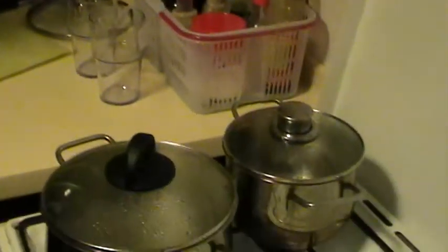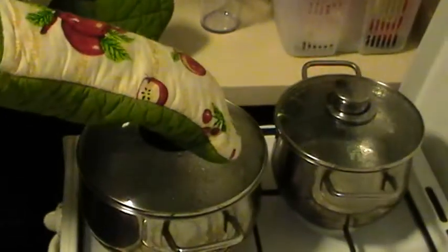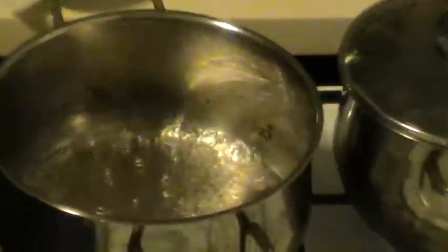So it's now about 5 minutes and 18 seconds. Let's have a look. Oh boy, stand aside. Now we have the pure water boiling at an incredibly fast rate. If you look from 4 minutes, even more bubbles have come. And you see a little formation down there. And it's boiling really vigorously. Even there as well. Now look at the salt water.